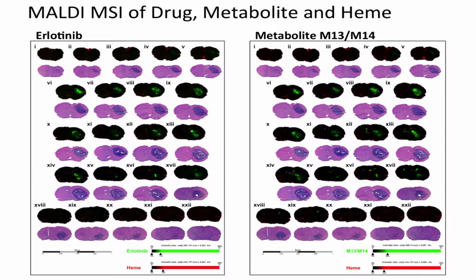So 1 data set here, when we want to do a 3D reconstruction where we take sections from the frontal to the posterior part of the brain, each tissue section here is 70 gigabytes of data. And 1 full reconstruction like this can be 2 terabytes. So needless to say, we don't do this on every single animal that Jan produces. But basically, we try to extract some of the information from here.